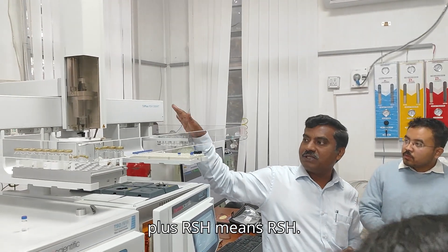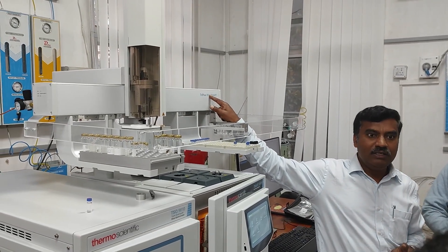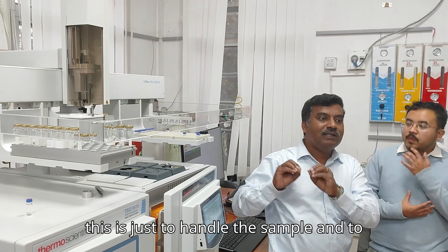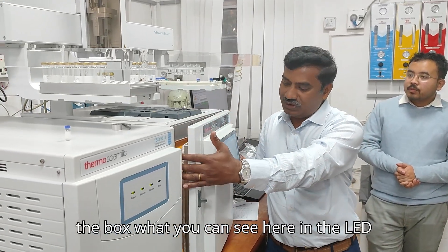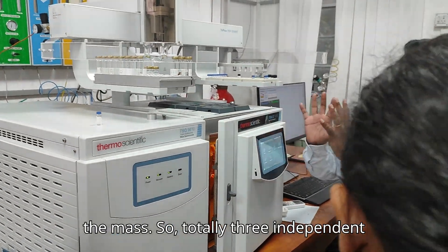TriPlus RSH stands for RSH — robotic sample handling. So robotic sample handling is all about auto-sample or auto-inject. This is just to handle the sample and inject it into the GC system. Separation happens in the GC. What you can see here is the LED screen — this is just a box. So totally three independent devices.